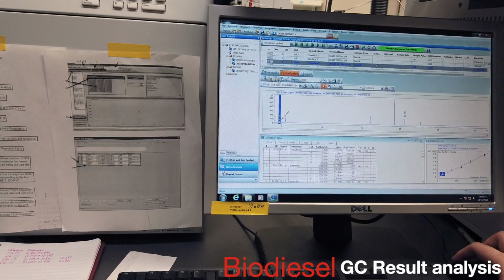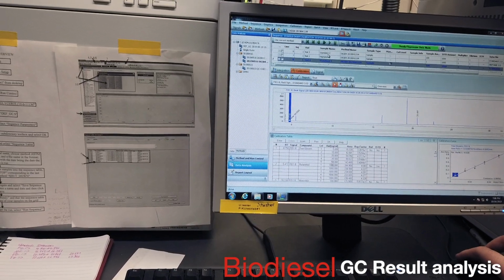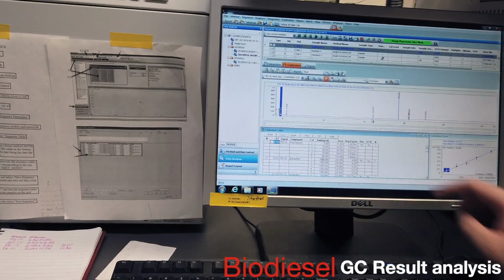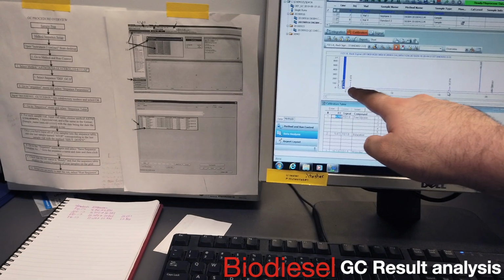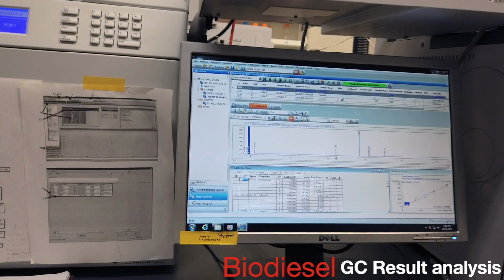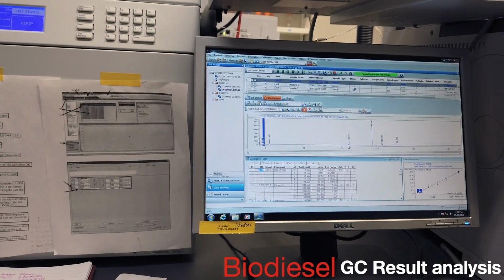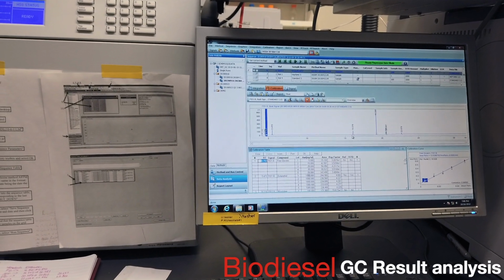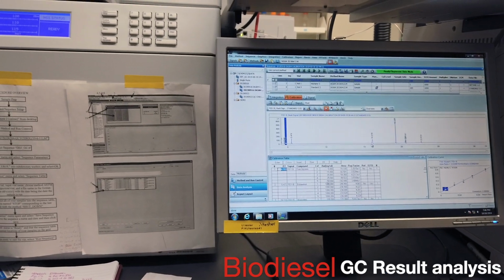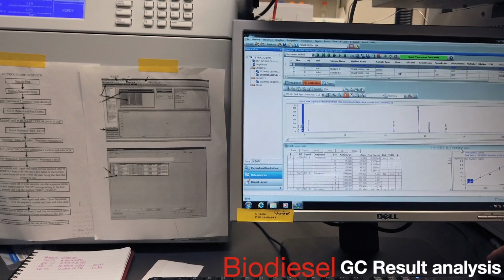What did you delete? I didn't delete anything. Do not save the changes to the signal. If I were to click save, it would have deleted the integrations for all of those, because I didn't want it to update for the other ones, since for some reason it didn't save my integrations from last time. So I'm just going to roll with this. Okay, so I did that. I think this should hopefully be good.